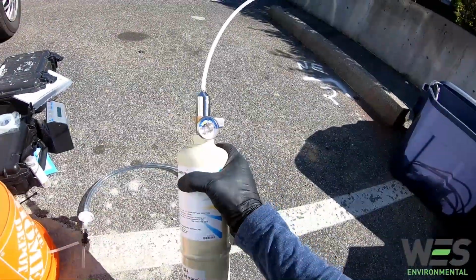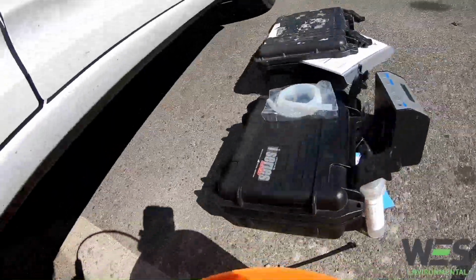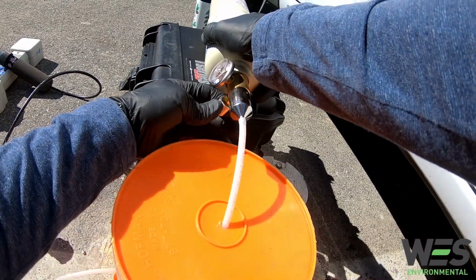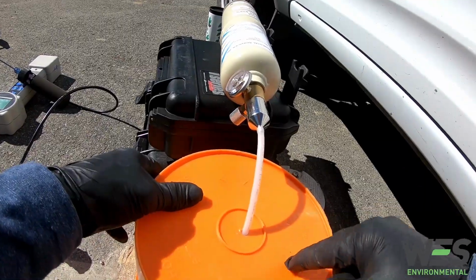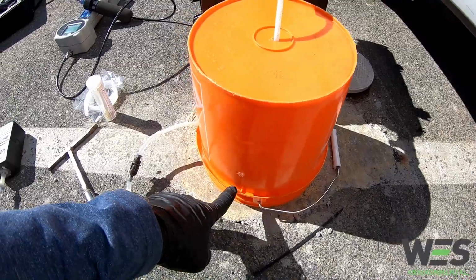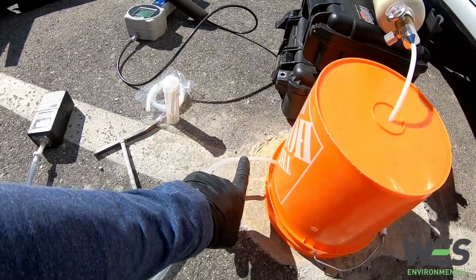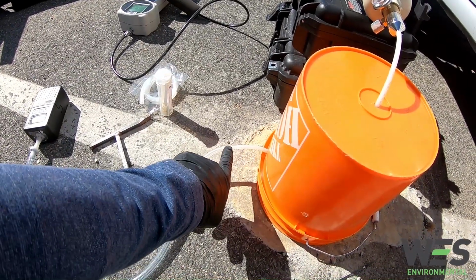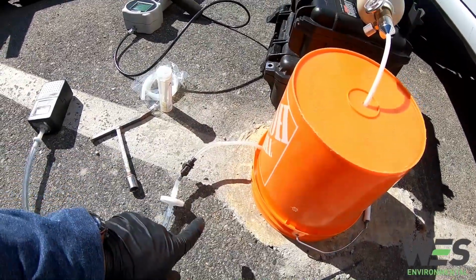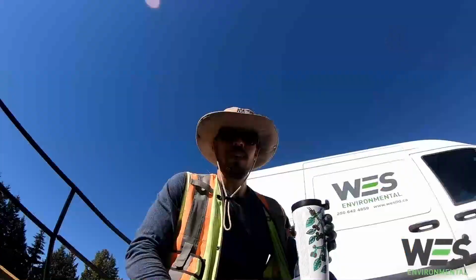Got the helium here, and helium's gonna go in here. I'm gonna turn the helium on fully. That's gonna pump the helium into the shroud here. I'm gonna wait till this guy fills up with about 50% helium, and then I'm going to stick the helium detector into the tubing, and if I get any more than 2% helium in the line, that means there's a leak somewhere in the system, and I'm going to have to troubleshoot that. So let's see what we get.